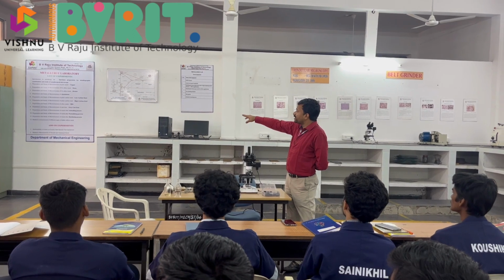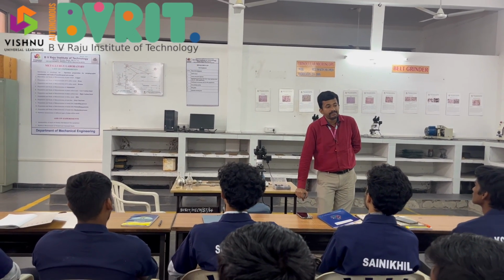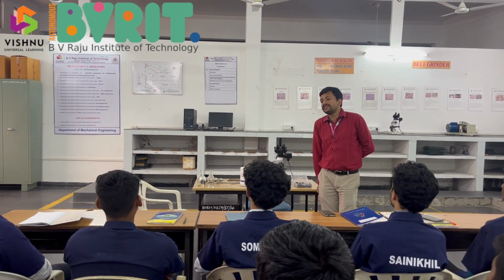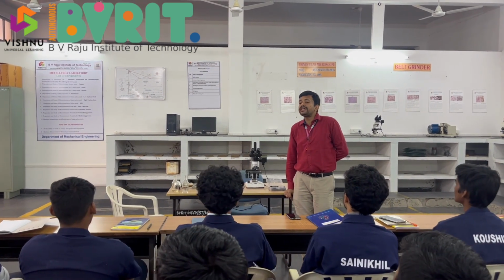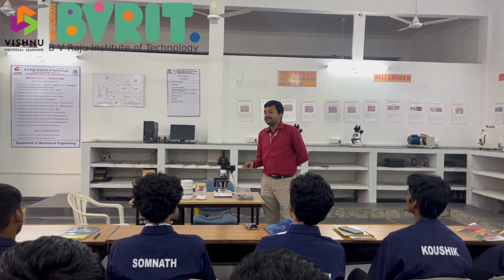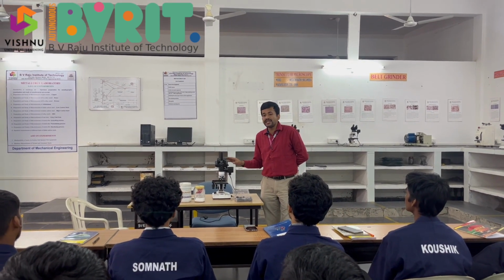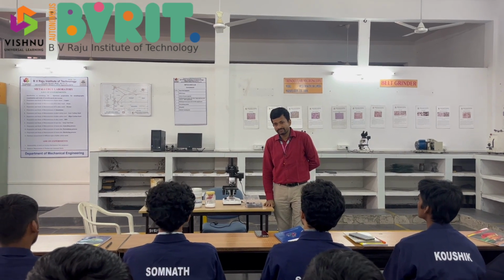But coming to 9th, 10th and 11th, they come under the heat treatment processes. So that is what we do for enhancing the properties. That also we'll come to know slowly. So annealing, normalizing and hardening are the processes. When we perform annealing, normalizing and hardening, there will be a slight change in the microstructure. That also we'll try to see under the microscope and note the microstructure.